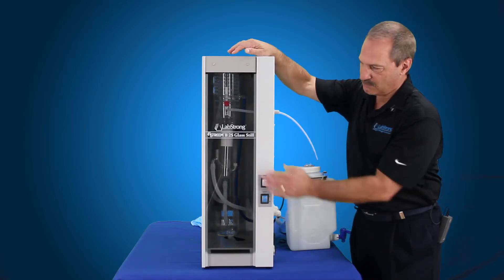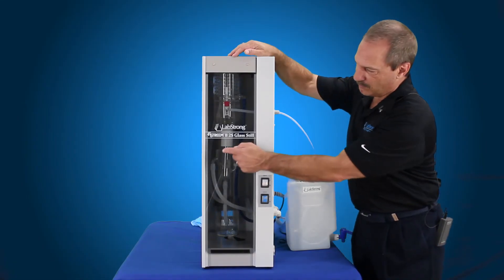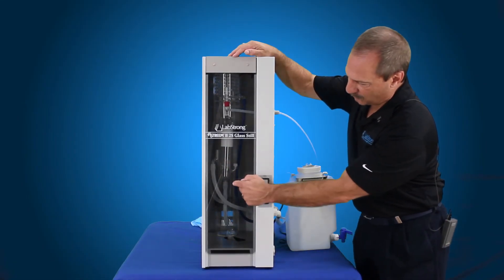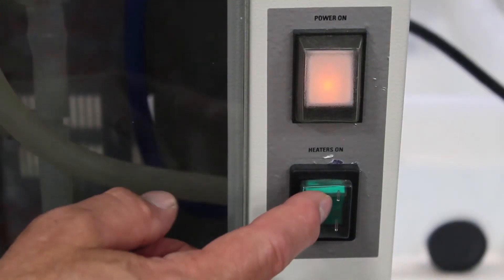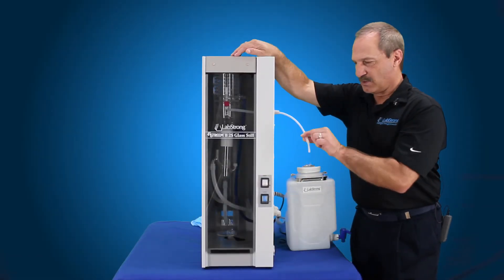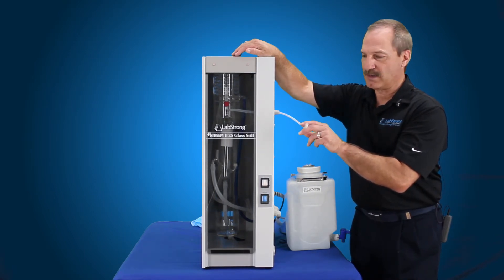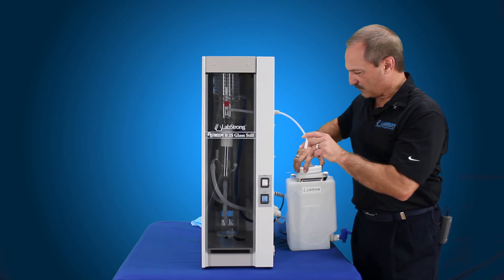We're just going to hit the power button to bring our water in. We're going to bring it up to our constant level device and overflow. Once it hits that point, we're going to go ahead and turn the heaters on so we can start distilling water. Then you want to run this to drain. After about four or five liters to drain, you want to go ahead and connect this back up to your tank.